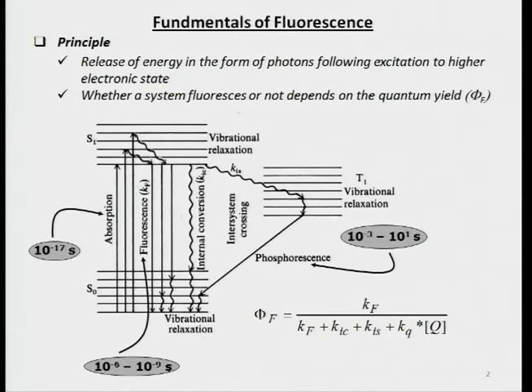This occurs really fast. This is essentially instantaneous. This is where the molecules just do not move. They are absolutely stable. Nothing has happened. It's almost like the molecule is zapped and you have an excitation. So you do get absorption, which tells you a lot about concentration, things of that sort. But for the most part, that's not very useful.